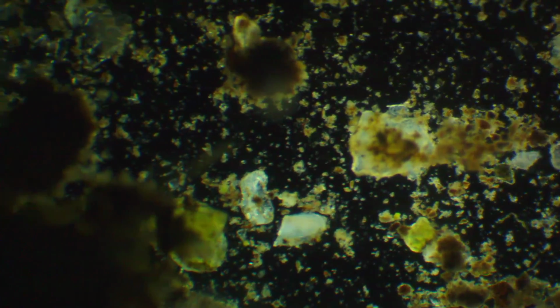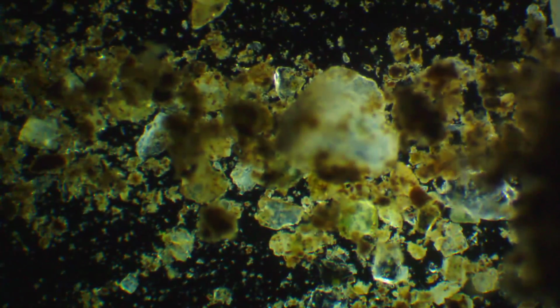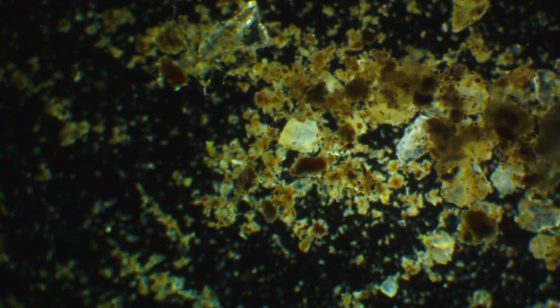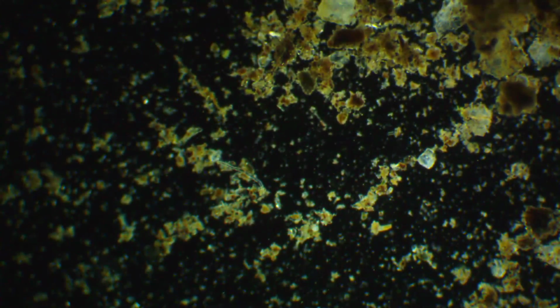Technically, a lot of this plant material is dead. Some of it's still alive, some of it's still able to photosynthesize. That looks like a dead worm to me. Jiggle, jiggle. I shake the table and I jiggle the slide to see if it's dead.